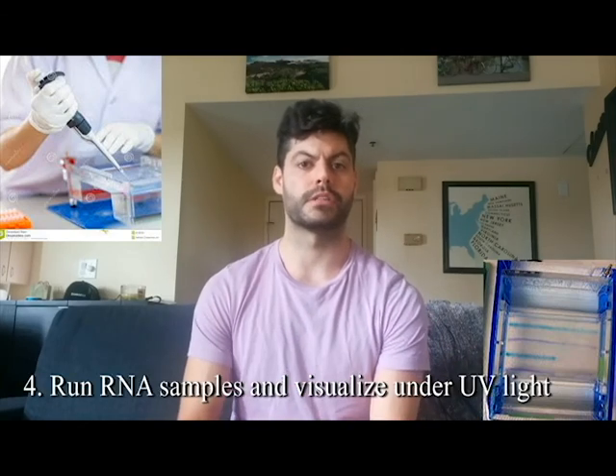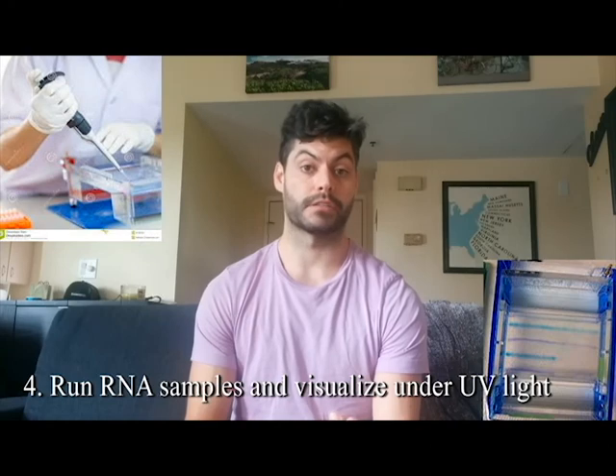After the gel is set, put it in your rack and load your RNA sample. You want at least 200 nanograms of RNA to see the product. Based on the concentration from the nanodrop, add that volume of RNA to a volume of DNA loading dye — those are common in most labs. Load the sample into one of the wells and run the gel; it doesn't usually take too long. Watch for the front to migrate down and check periodically for band separation.